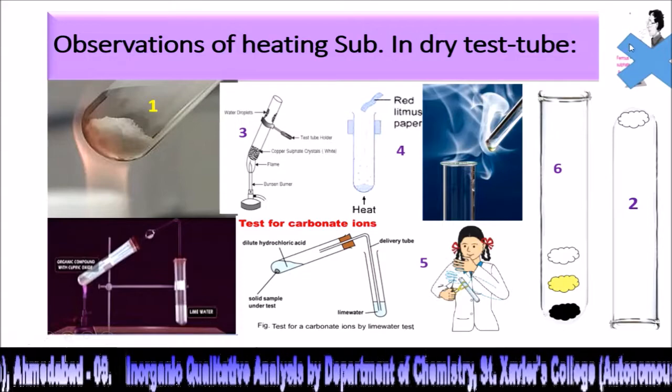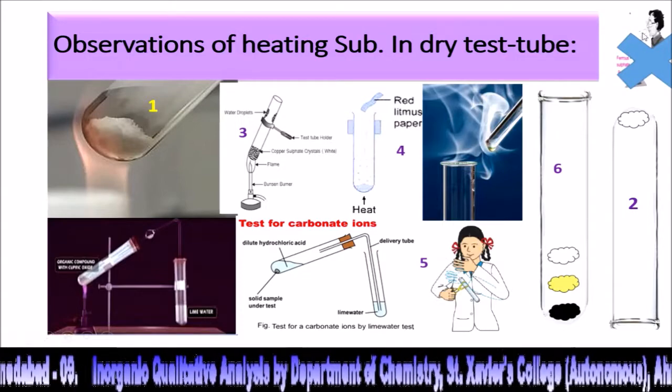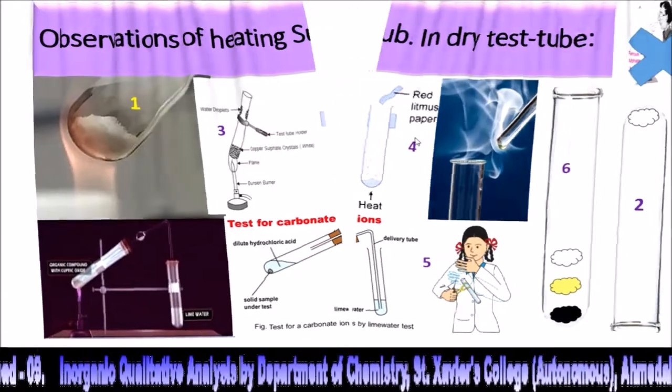Do not smell the compound directly. It is strictly prohibited. So 6 observations are there for the first test.